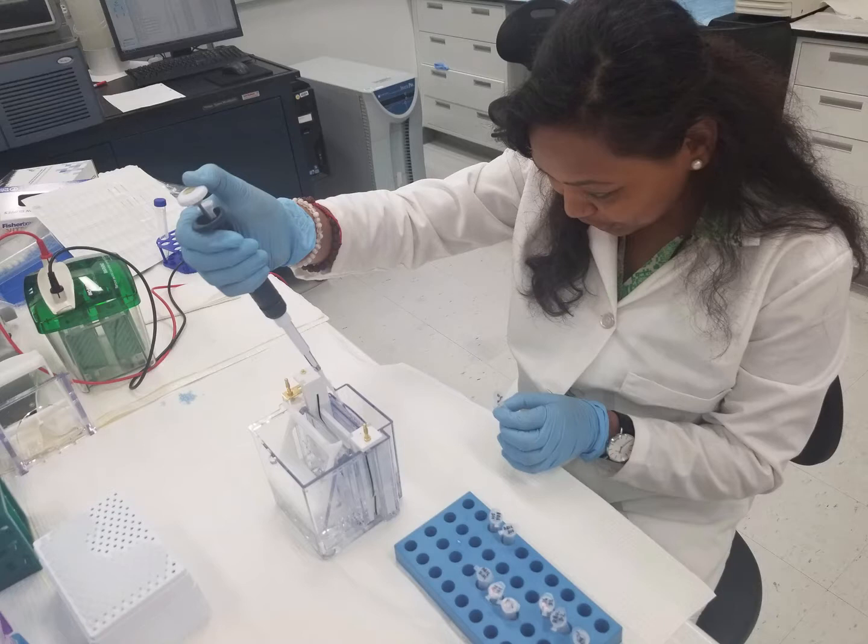I think SDS-PAGE is amazing the way it separates proteins based on their molecular size. Since the method is based on the separation of proteins according to size, the method can also be used to determine the relative molecular mass of proteins. How? We will see later in this video.